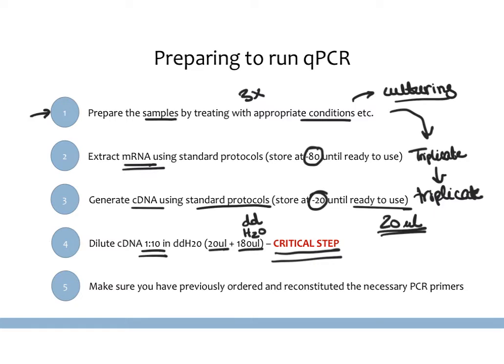And then you will need your primers. So before you do any of the actual reactions, you should make sure that you have ordered and reconstituted the PCR primers for the gene that you are interested in.